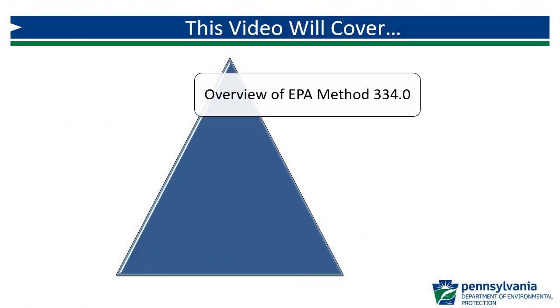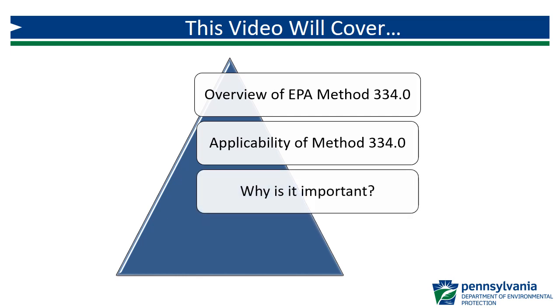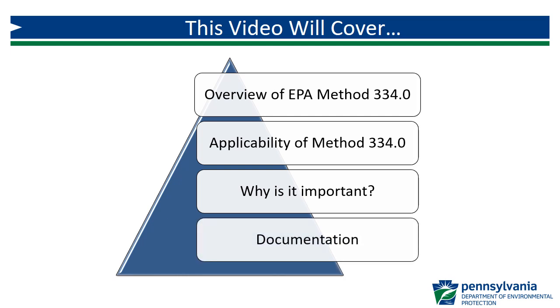In this introductory video, we will be covering the following topics. We will begin with an overview of EPA Method 334.0. We will then look at the applicability of Method 334.0. Who needs to be following this method? Then we will cover why it is important to follow Method 334.0. And finally, we will end this video with documentation.